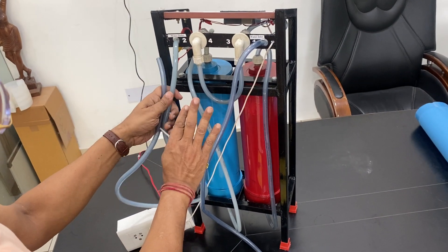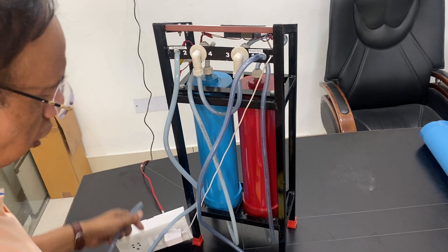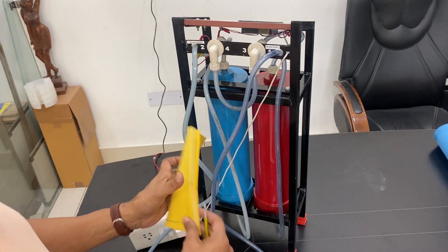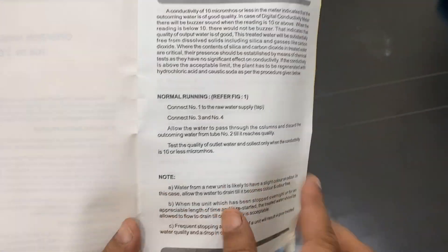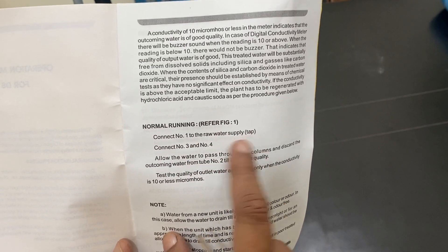This is not distilled water — this is deionized water, meaning it will remove all the impurities. The manual is included. It tells you the working parts and instructs you to connect tube one to the raw tap water.